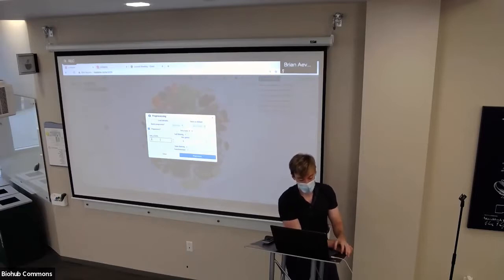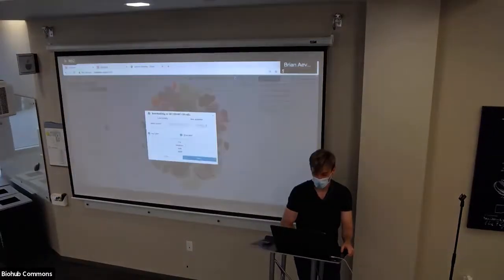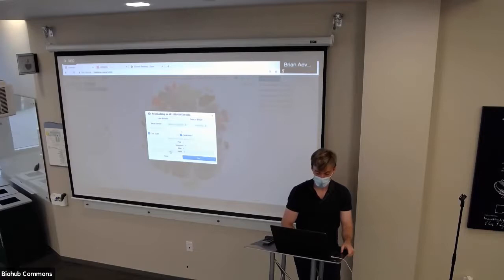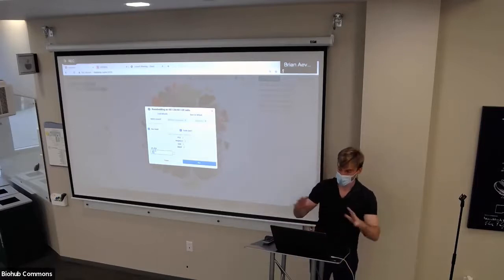There are other methods that automatically do it for you based on statistics, like empty drops for 10x data, which I might integrate into the front end. But ideally, for the pre-processing, we'd have histograms. For re-embedding, the only thing they might play around with is this min dist parameter and maybe the number of principal components. And scale data is also something they would use. So min dist would basically control the concentratedness of your UMAP. If you made it small, it would be more concentrated; if you made it higher, it would be more spread out.